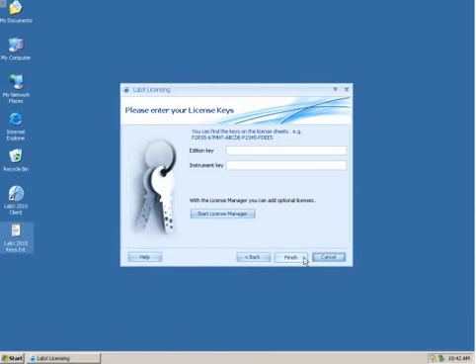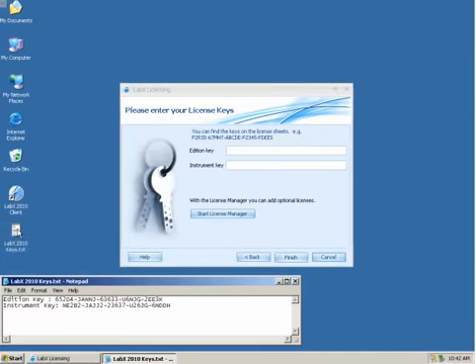For convenience and demonstration purposes, we have already typed the keys in a text file. LabX is currently available in two editions: Express and Server. Exposed system functionality and modules installed are fully controlled by the license manager. In order to simplify the installation steps and minimize user interactions, all information regarding components required is encrypted in the license keys supplied. For our demonstration, the edition key is linked to a full server edition, and the instrument key is linked with one LiquiPhysics instrument.